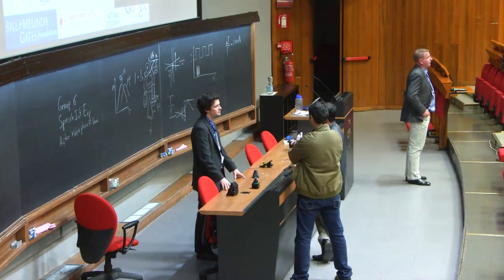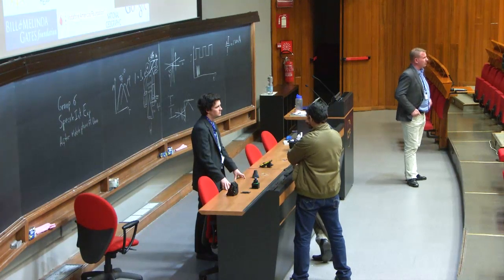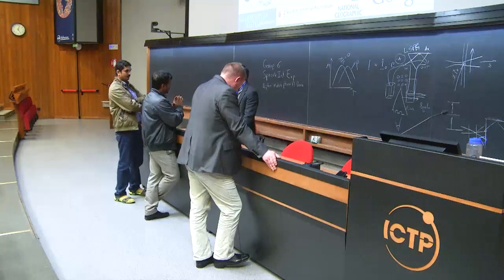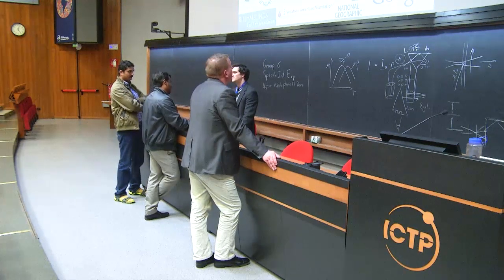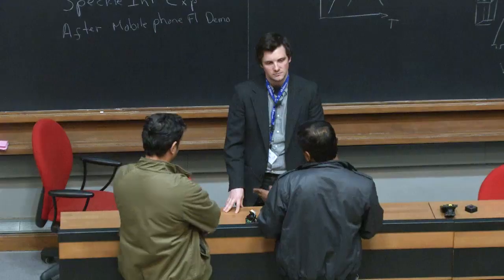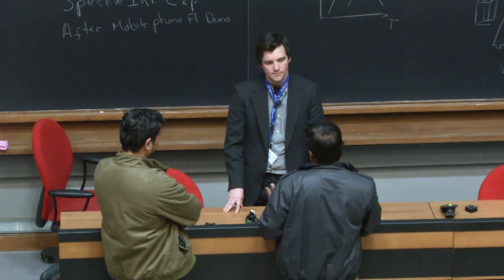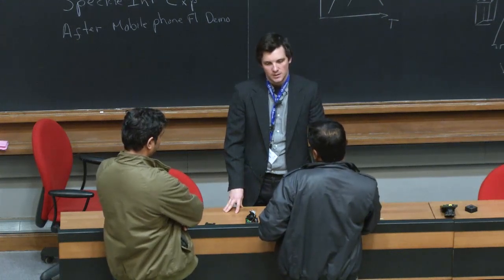Of the camera. That's what I'm saying. The bottleneck is the pixel, because you end up there and so on and so forth. But normal CCD cameras, background and so. Of pixel size.